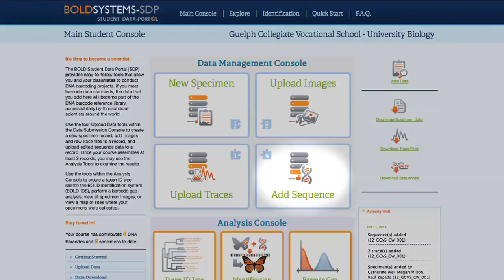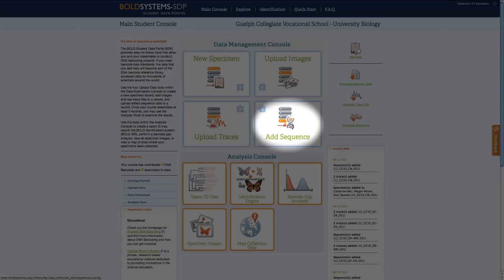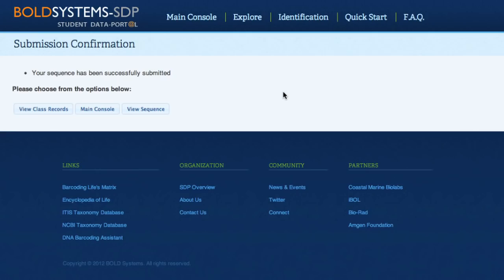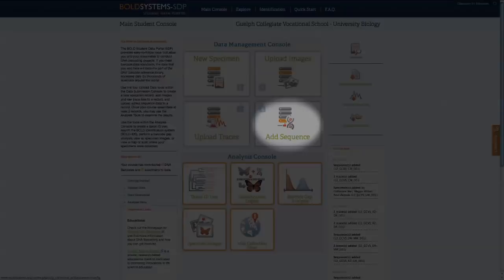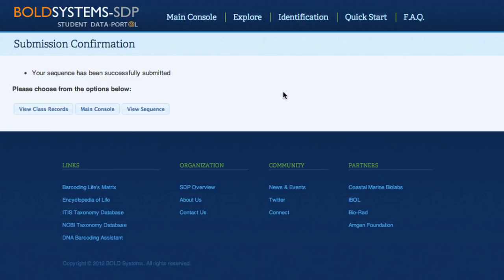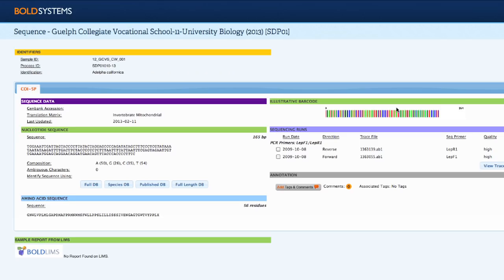The final step in creating your DNA barcode record is to add a sequence. Select Add Sequence from the main student console. Sequence uploading is a fairly straightforward process on BoldSDP, but editing your sequence requires more in-depth instruction — please see video 4 for more information. Once the sequence has been uploaded, students will be taken to a confirmation page where they will be able to view the sequence page for their record, containing the newly edited sequence and trace files.